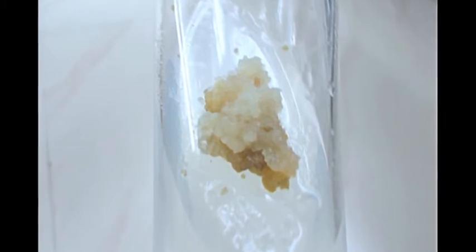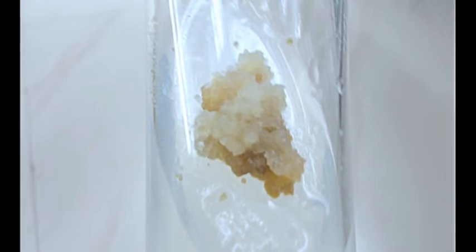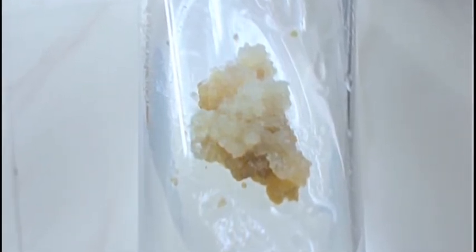After about 2 weeks, calli may start appearing on the surface of the explants, and friable calli will be formed after about 4 weeks. The growth curve for the callus can be established by measuring fresh weight at 4-day intervals during a 32-day period, followed by subculturing every 32nd day.